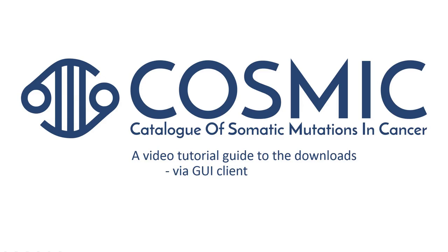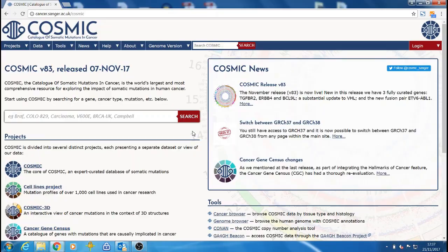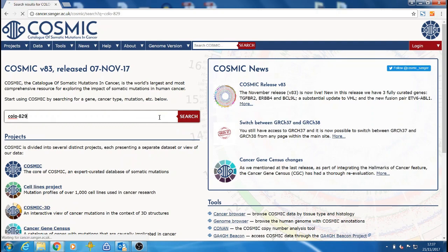Welcome to the COSMIC video tutorials. This video will be about downloading the COSMIC data files. All the data from COSMIC is available to download and this can be done in several ways depending on the size of the file you want.